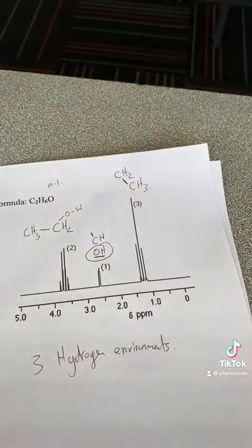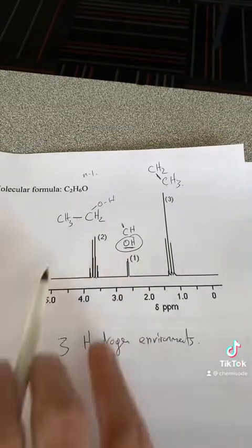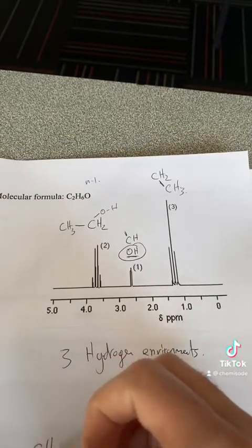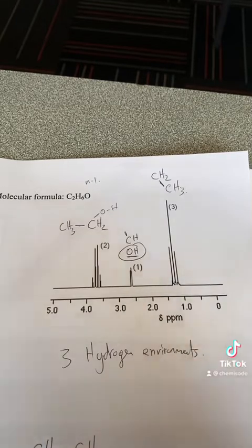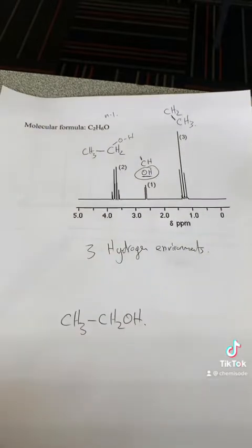What that means is I put all this together and come up with a structure which makes sense. So let's start off with my edge pieces, which is a CH3. That is going to be bonded to a CH2, and I'm going to have an OH there somewhere, which makes sense, and it's going to sit here. And that's how I've analysed this spectrum to come up with this structure.